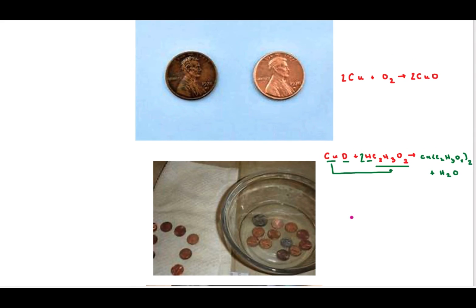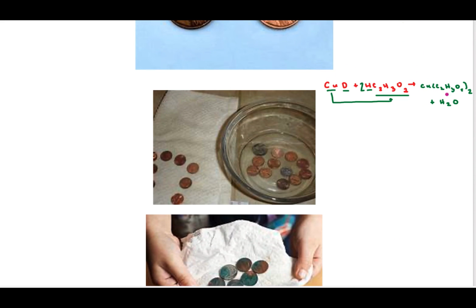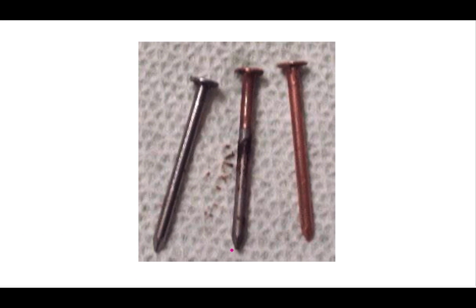We started with copper oxide, right? We allowed it to react with our vinegar to form copper acetate and water. Okay, that copper acetate is mostly just copper ions that we'll see. And the copper ions reacted with oxygen and chlorine to form that malachite, but then also the copper is going to be left in solution with the chloride as well, because we kept that solution. We didn't dispose of that solution. So when we added an iron to that copper chloride solution, this now is going to be another type of reaction, not synthesis, not double replacement, but this is a single replacement reaction.